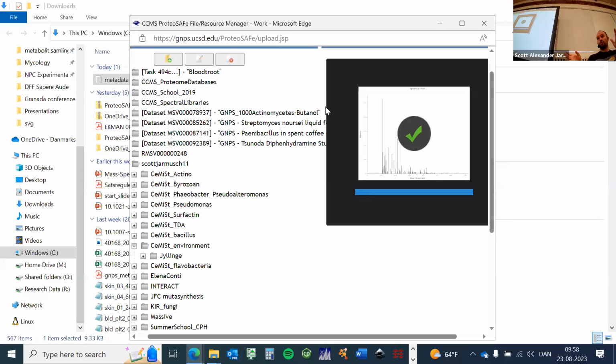So now, obviously, you may ask, what are we doing if we have files that are larger than 20 megabytes, especially dealing with the raw mzML files? That's typically the case. So then we recommend using an FTP client, such as WinSCP or FileZilla, to actually upload this. It's a little bit more practical to use, but for time's sake and ease of use, we just quickly use this web interface because it doesn't require you to install anything.